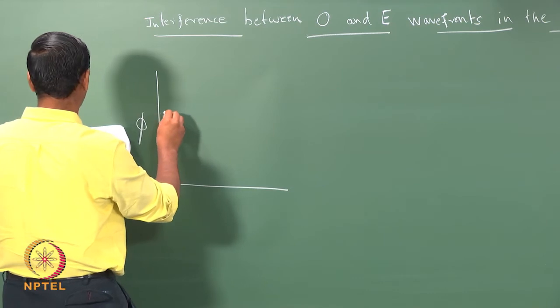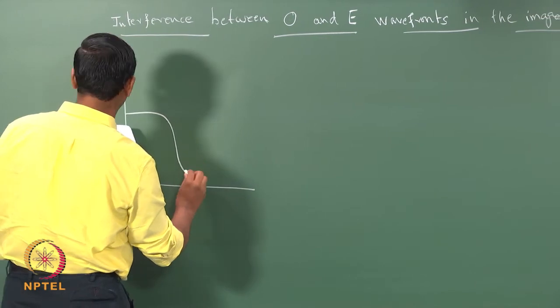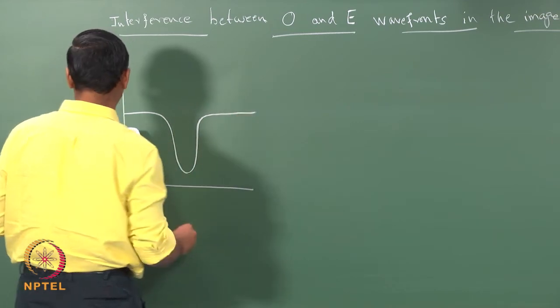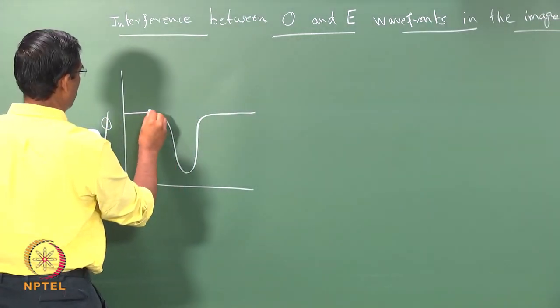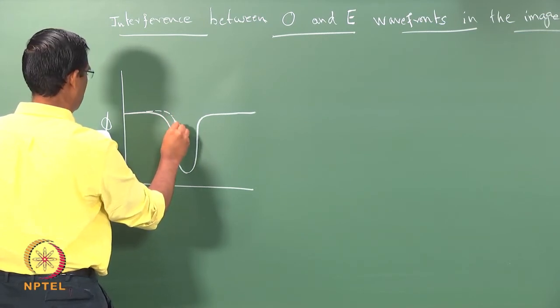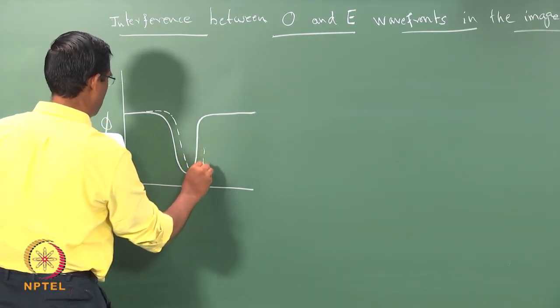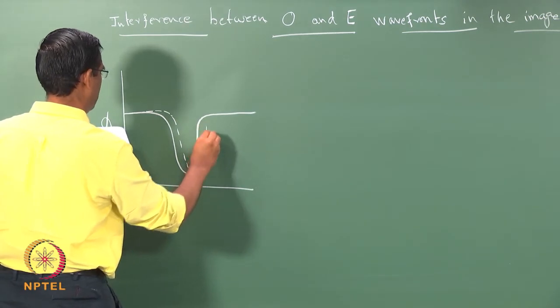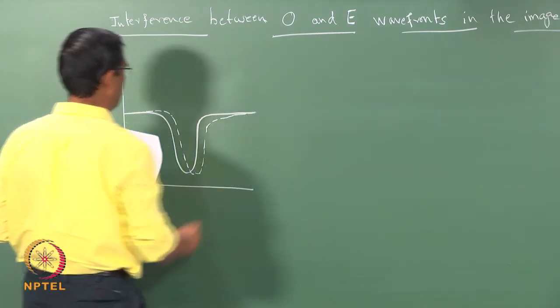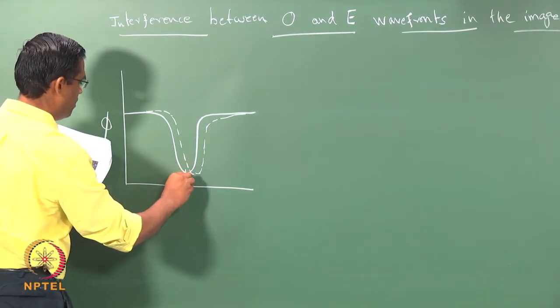We are now going to talk about the interaction of this ordinary and extraordinary wave, which is coming out of the beam splitter and then through the specimen.